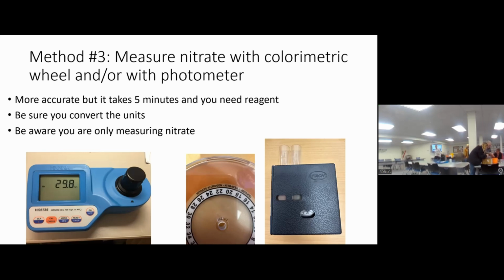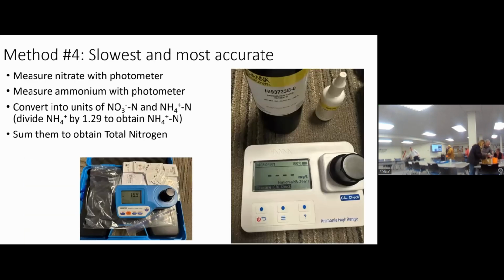All right, you guys are gonna measure ammonium. Everything is gonna measure everything at the end. You guys are gonna do that with ammonium. So I made a solution for you. This is the solution you're gonna use. So this is the cuvette you're gonna use.